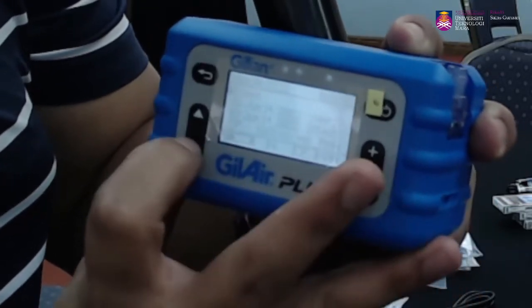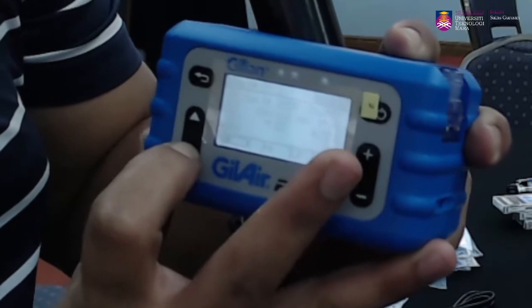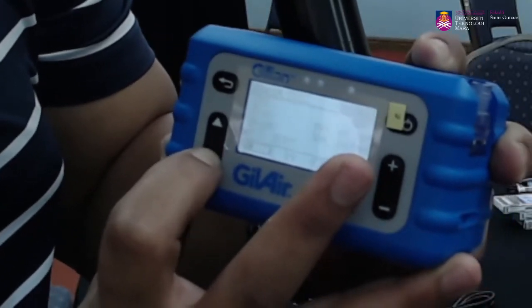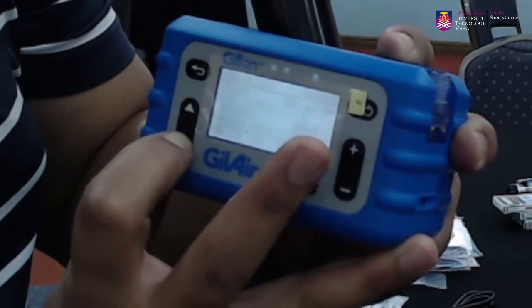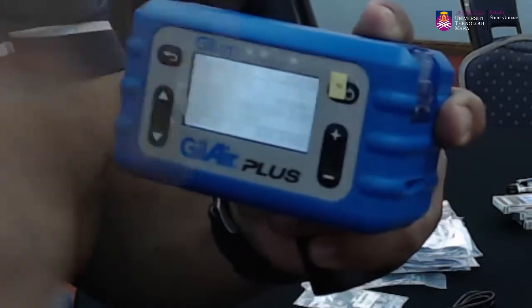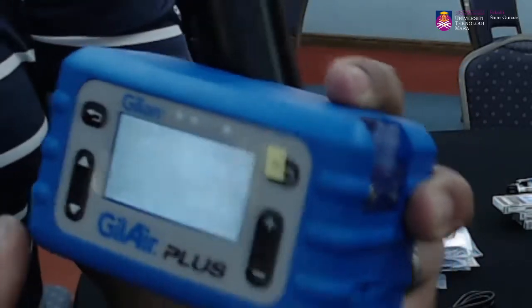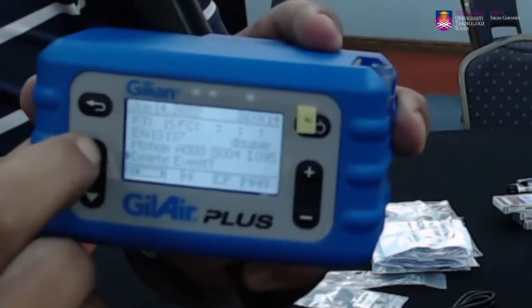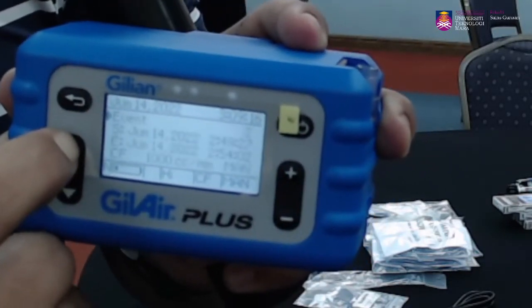So kita boleh scroll ke bawah in terms of apa dia punya general runtime berapa, and then in terms of kita punya pre and post calibration, and then in terms of motion. So dia akan bagilah segala yang kita boleh ambil in terms of general saja. So daripada situ kita boleh analyse and then tengok in terms of last kita buat apa, and then pump ni digunakan macam mana.